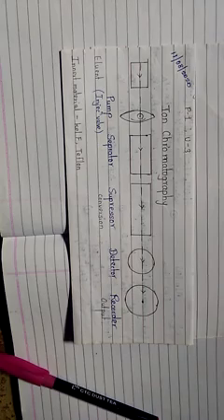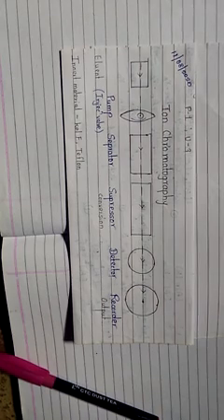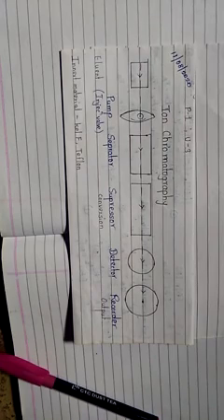For the separation, minimum amount of time is required, and the concentration of the sample is in nano, that is 10 raised to minus 9. From this you can understand that a very small volume of liquid is required, and multi-element separation takes place, and the analysis with greater selectivity of separation also takes place.